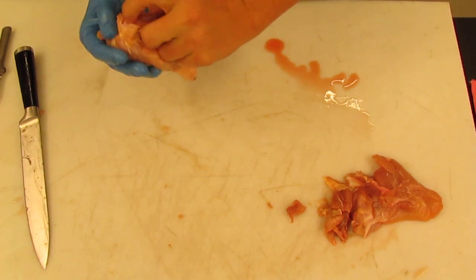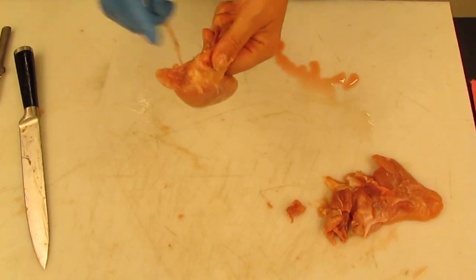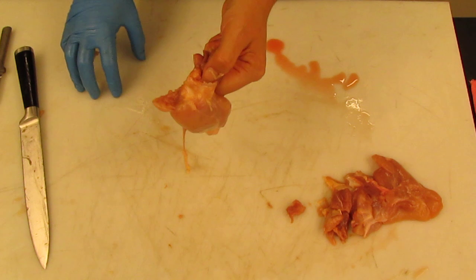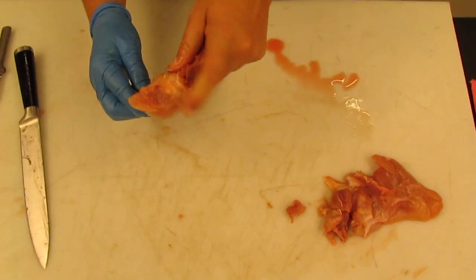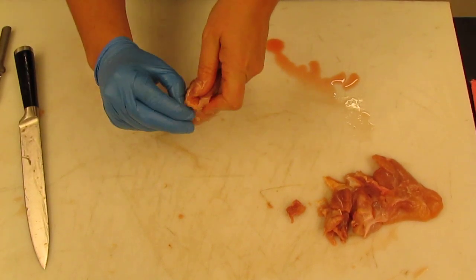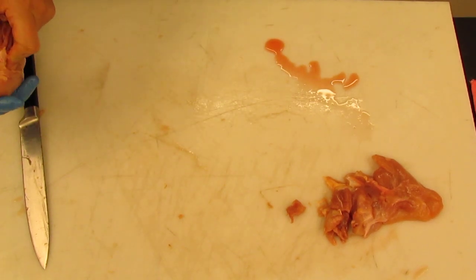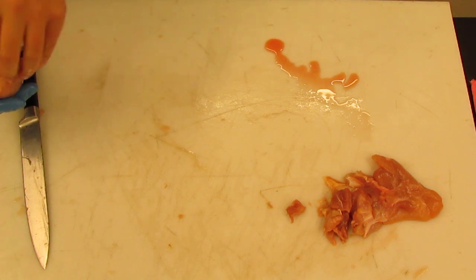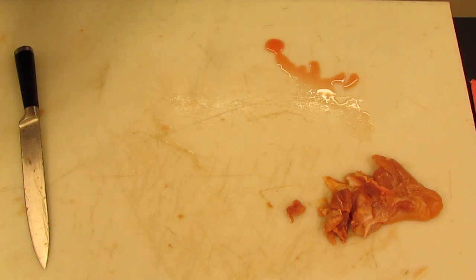Okay, so now I want to actually look inside the knee so we can see the cruciate ligament and we can see the menisci. Okay, so again, feel for where the joint is. There is a joint capsule around the joint. Right, so this white shininess here is part of the joint capsule. It helps to keep that nice lubricating fluid inside. Also, we can see one of these lateral ligaments. Okay, these lateral ligaments right here, this is one of those lateral ligaments on the outside of the knee joint.